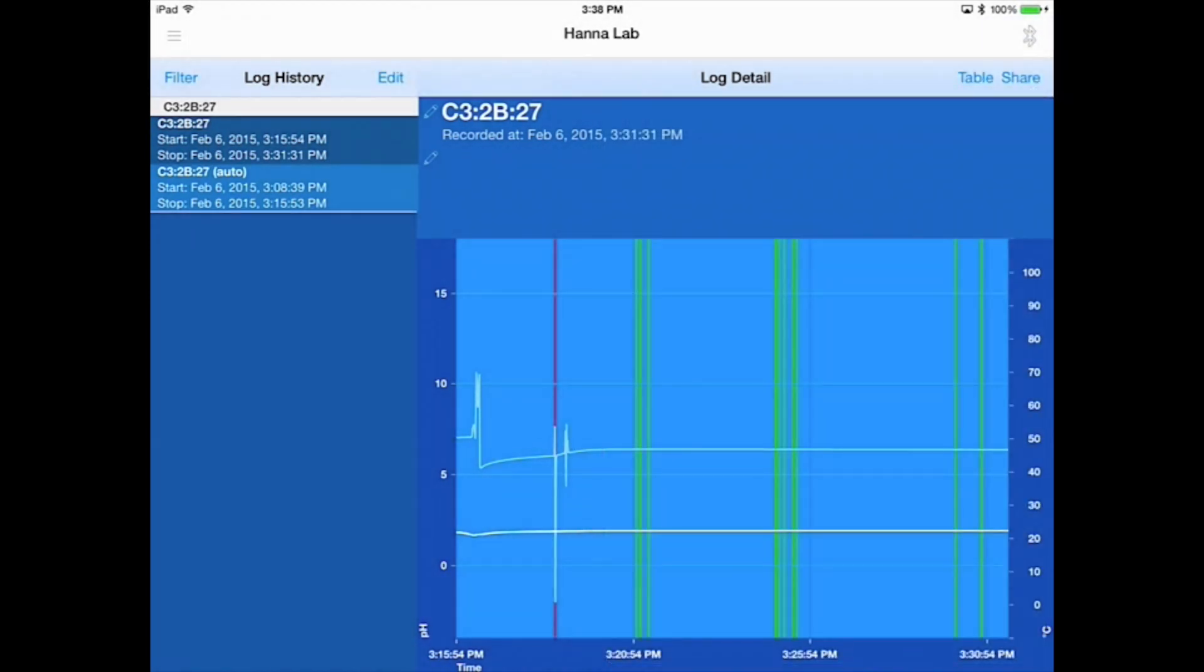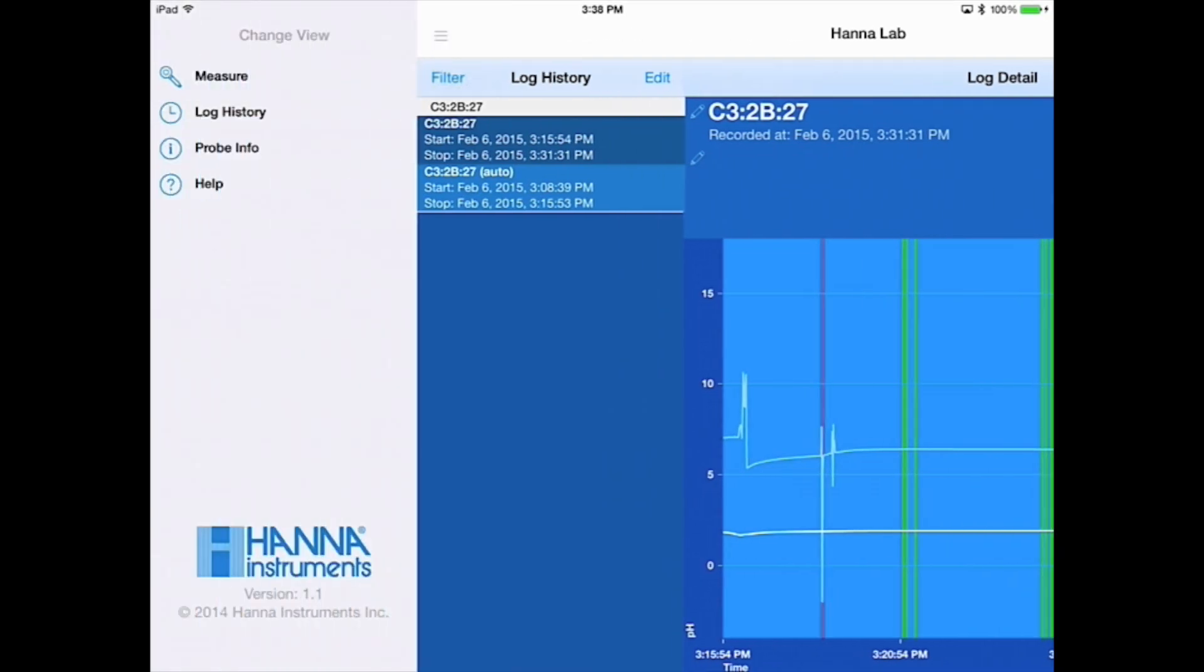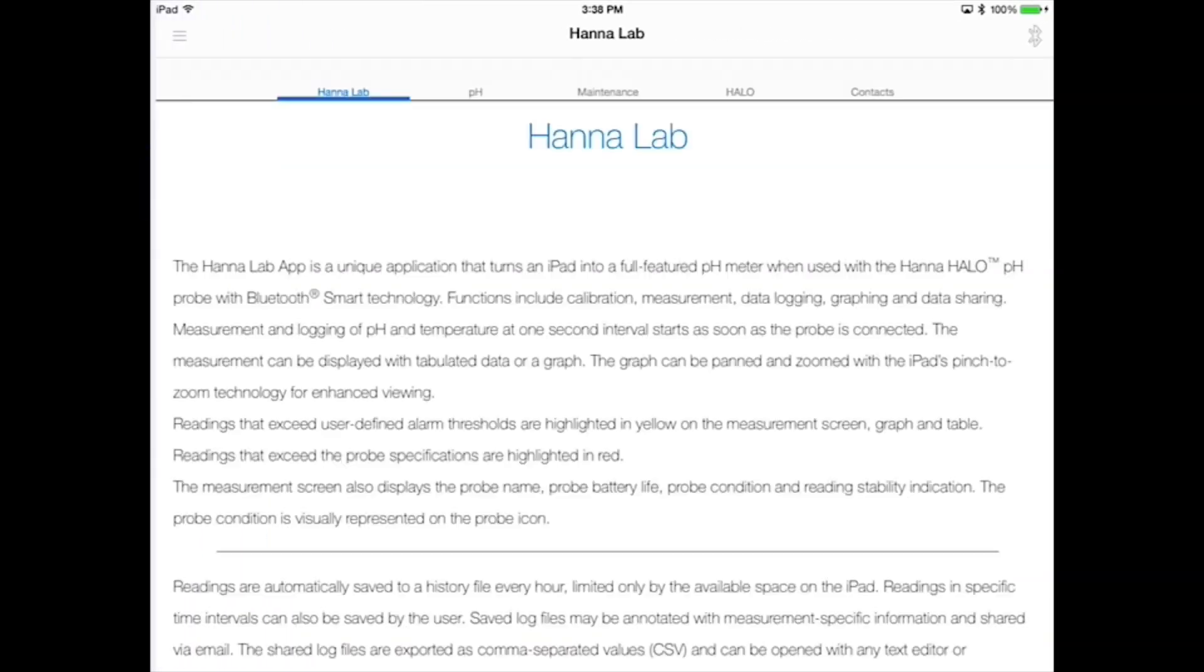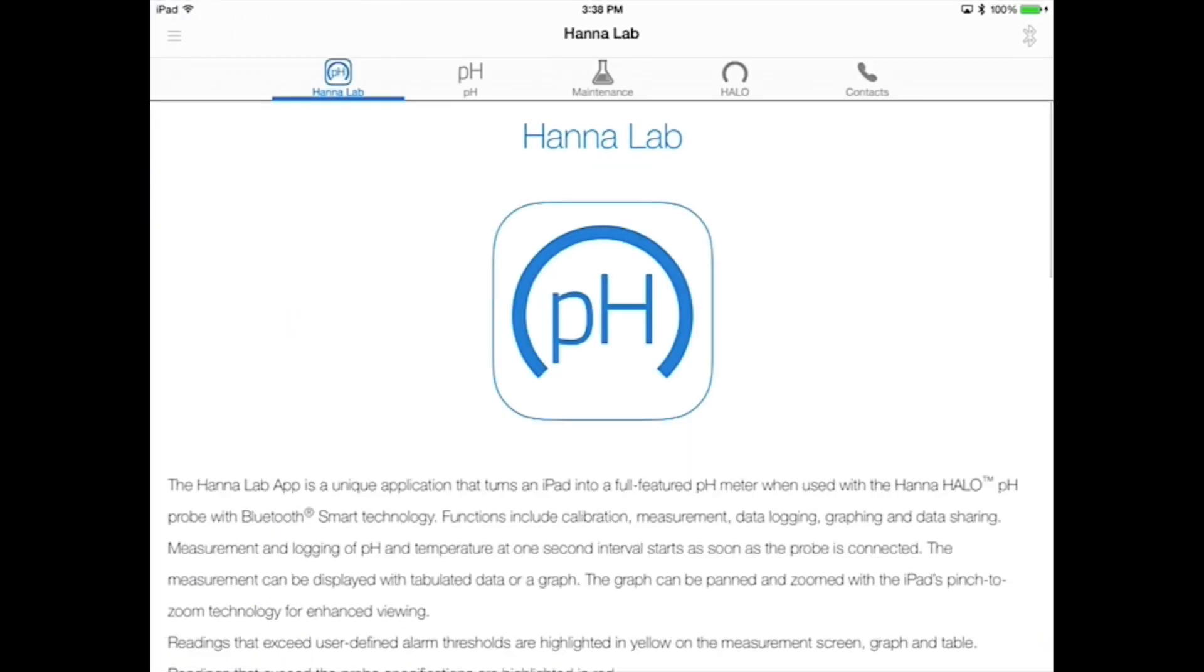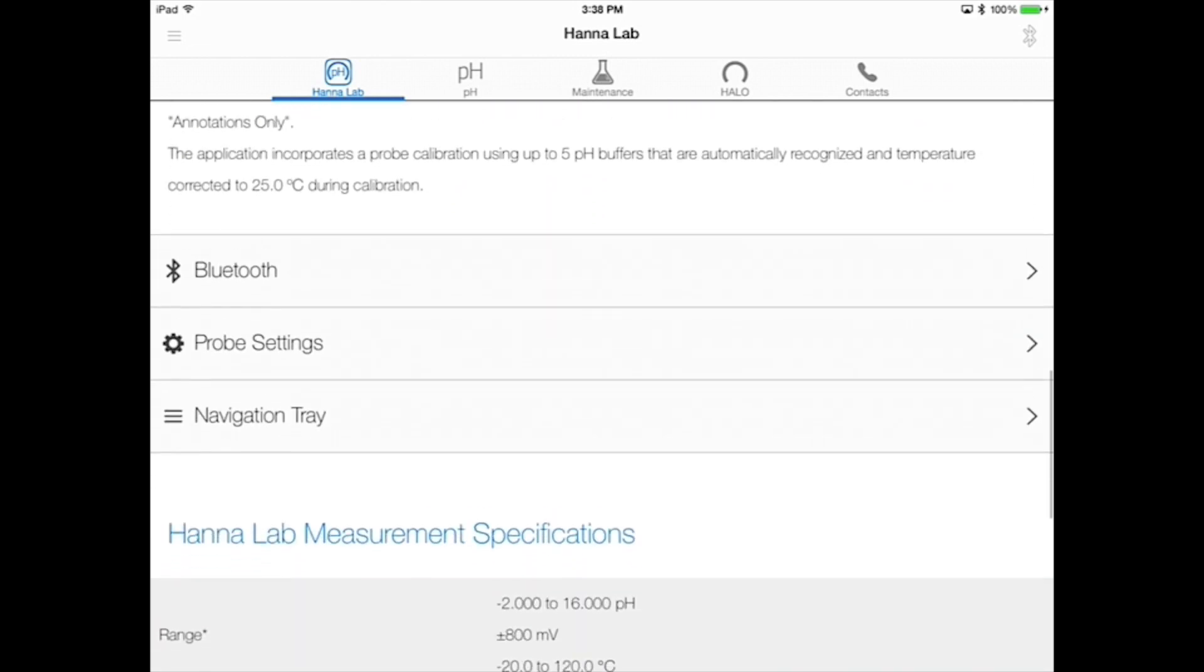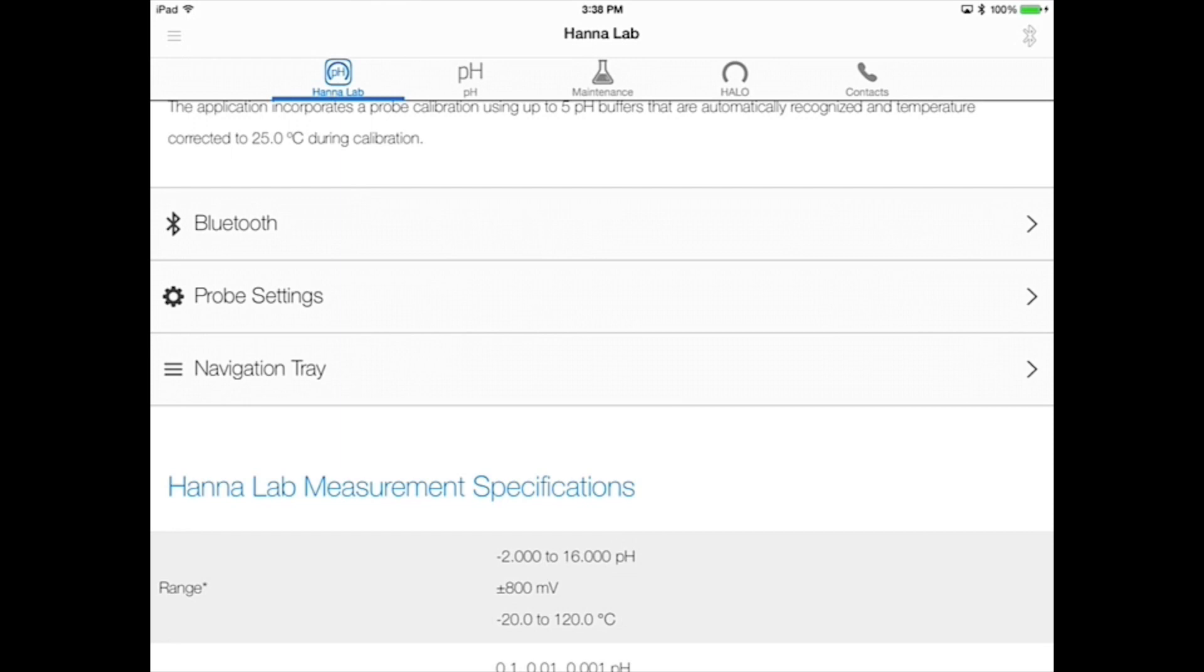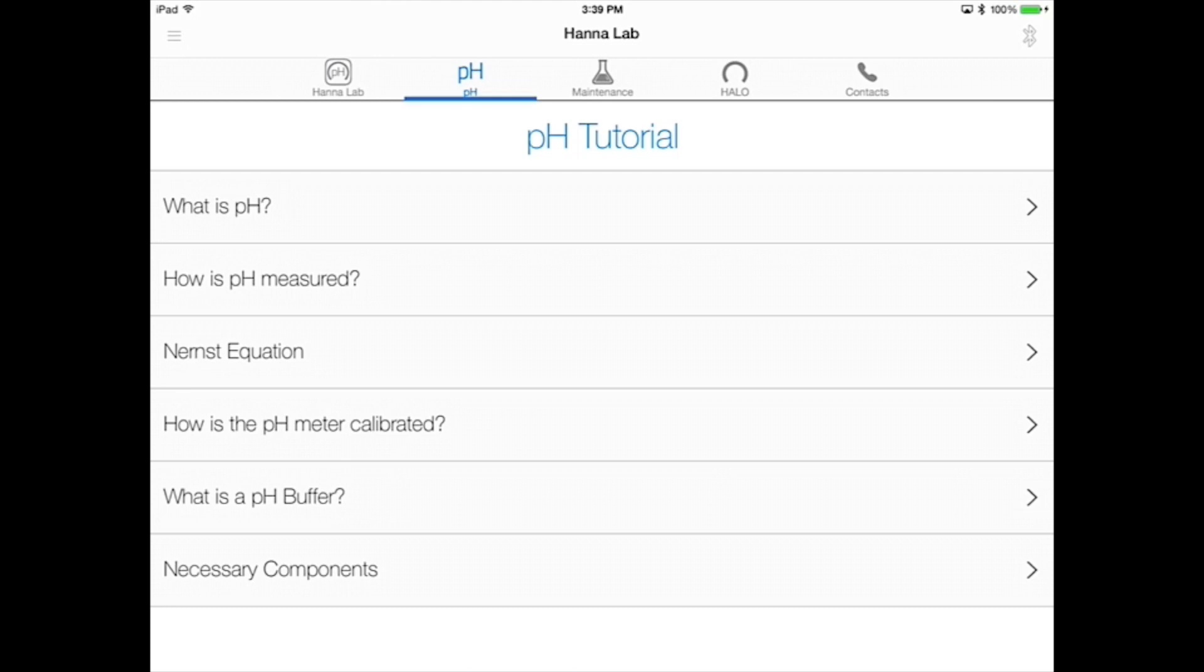If you have any questions about the HANA Lab app, swipe to the right and select the help screen. Here you'll find information on how to use the app to its fullest potential. There's a brief summary on Bluetooth connectivity, the probe settings menu, and how to navigate through the app. The general specifications for the app are also located here. If you're curious about pH or another parameter, there's also a pH tutorial found on the help screen. This will give you some background on pH theory and some practical tips to get you started.